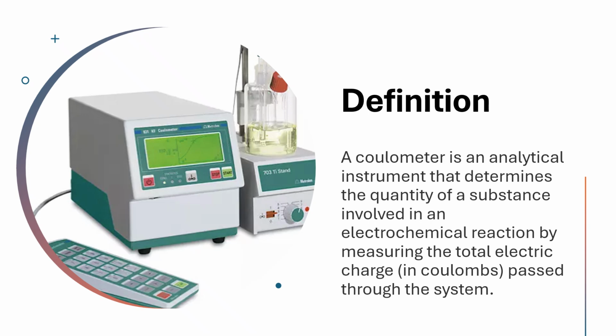Basically, the difference between the KF titrator and coulometer is that the KF titrator is used for high water content, and the coulometer is used for very low water content traces, typically from 1 ppm to 5%. That is the reason we use the coulometer for low water content traces.